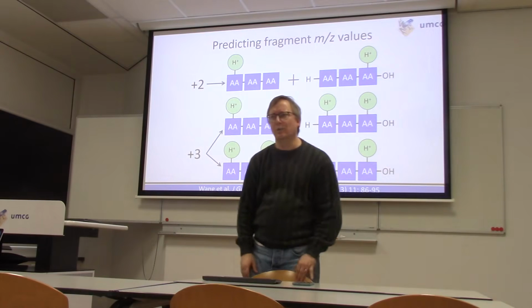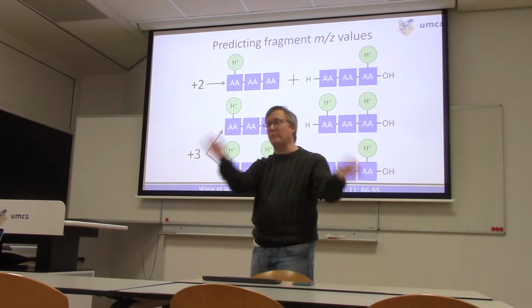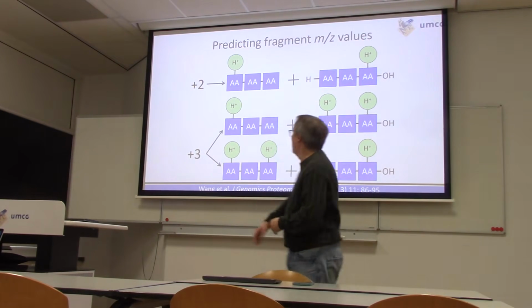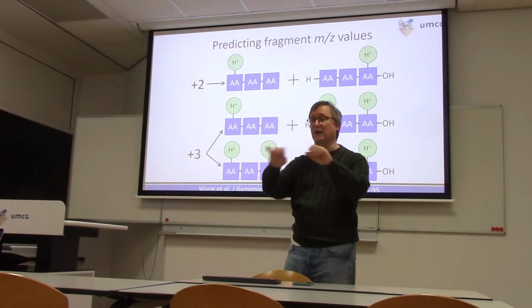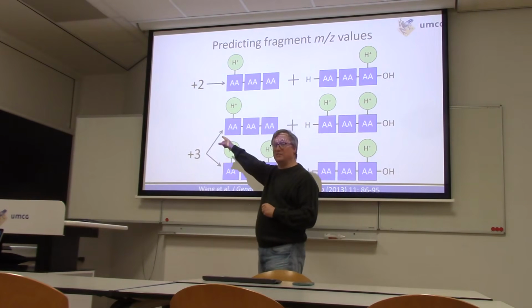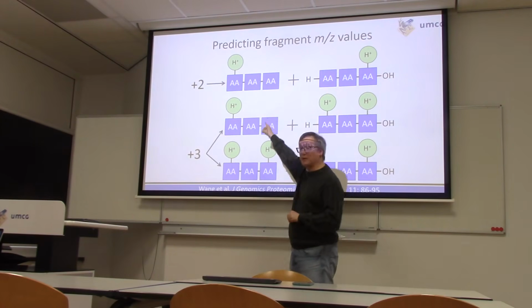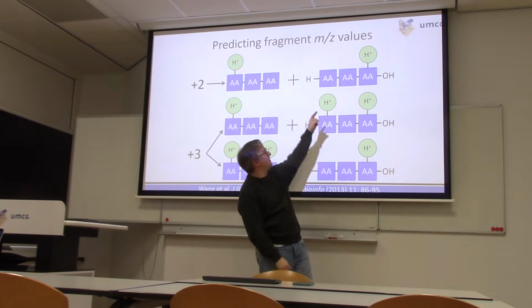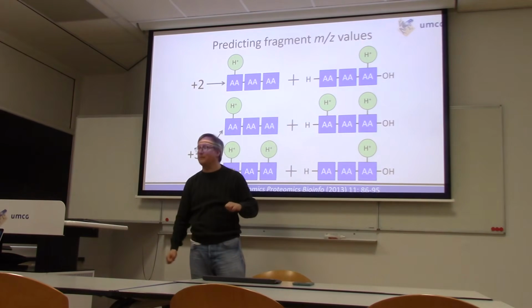Now finally, we have these peptide sequences, and we need to model what the MS/MS should look like if we blew apart this sequence to make them. All right, so let's imagine that we have a 6 amino acid peptide that's broken in the middle. If it started as a +2 peptide ion, when it breaks, the most likely scenario is that one proton goes with the N-terminal fragment and one proton goes with the C-terminal fragment. Those are shown by those green blobs up there.